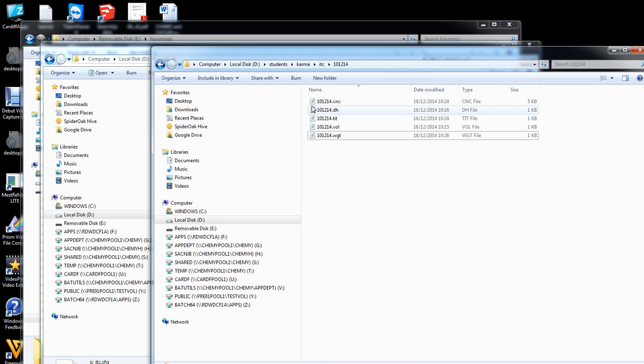So that should be this one. I'll check that by also counting further, because there should be 19 injections including this one that starts with a 0. Yeah, that makes sense. So now save this file, but now I've set that middle injection, that 5 microliter injection, to 0 as well. So now all of these files are ready for analysis.